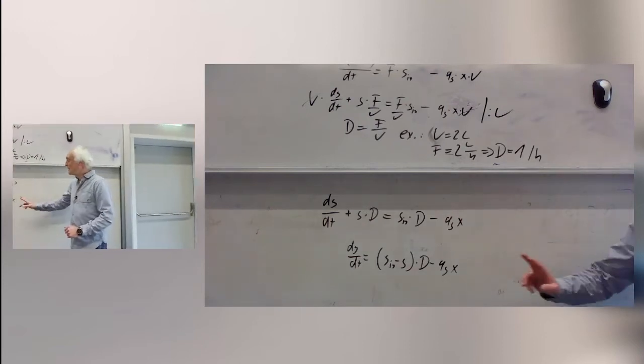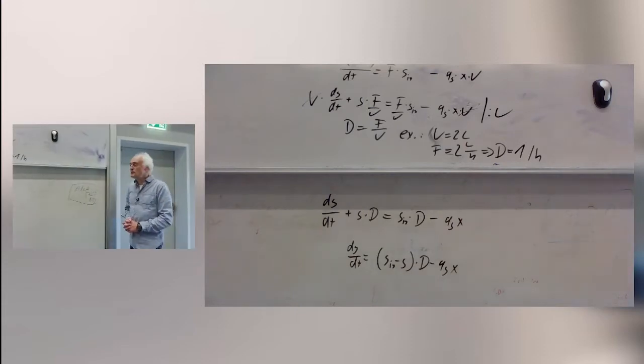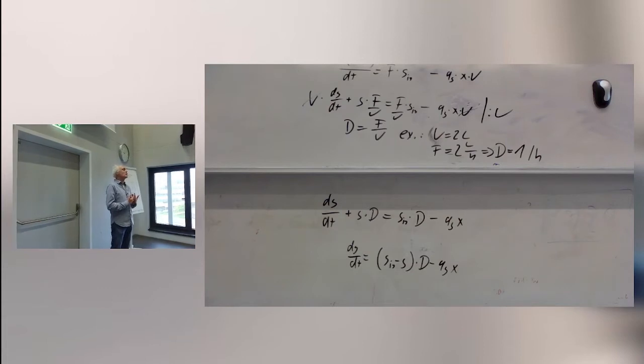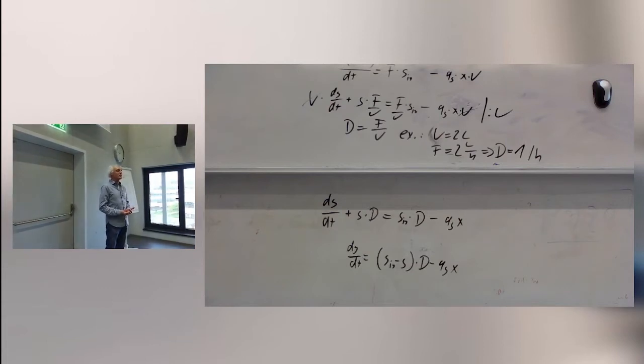Yeah. Okay, now what we're interested in is, of course, we can run this fed batch bioreactor with different operation modes. Yeah? So we could vary, at the end, the flow rate. For example, we could put in an exponential trajectory.